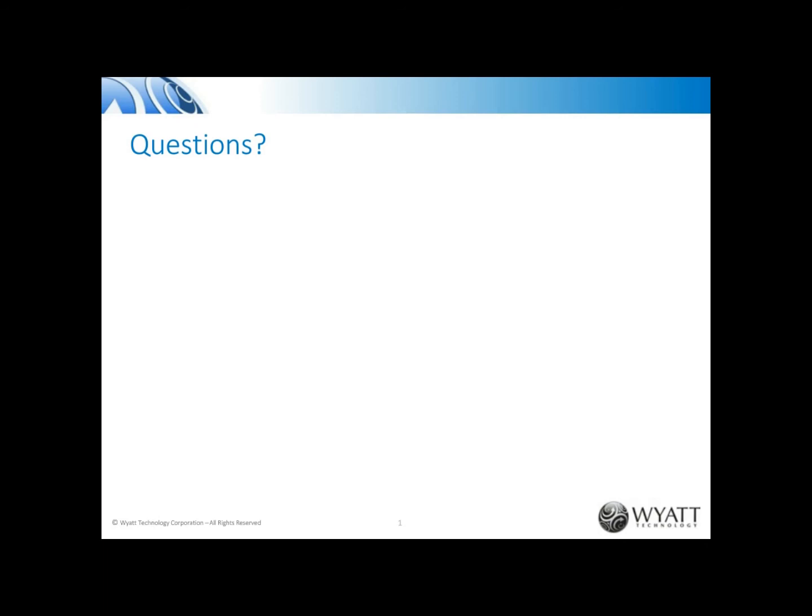You cannot use a refractive index detector anymore because you will get shifts in refractive index, as there will be a certain change in the composition during the analysis, but you can use light scattering and UV detectors. So it is possible to use mixtures. It's not that common. You try not to do that, but if it's necessary for your sample, it's a possibility.